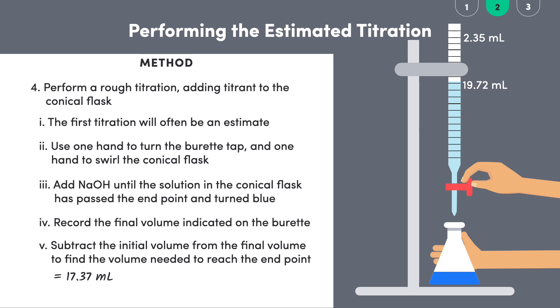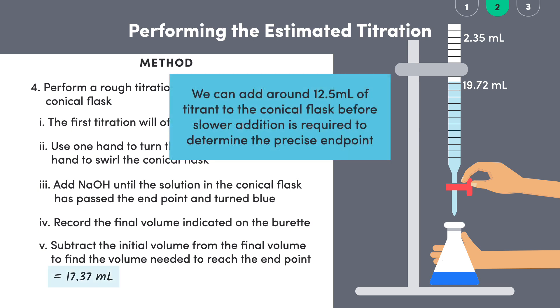But rough isn't good enough, since our key objective is to measure the precise volume of titrant required to reach the endpoint. So we just used this first result to say that we can confidently add around 12.5 milliliters of titrant to the conical flask before slower addition is required to determine the precise endpoint.